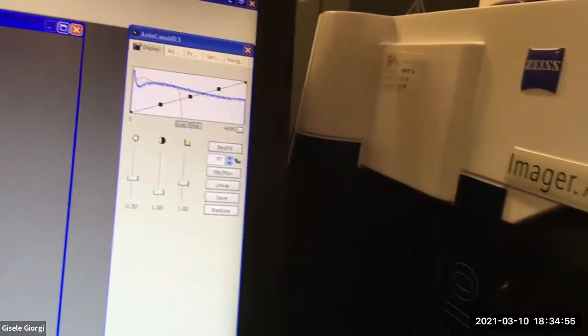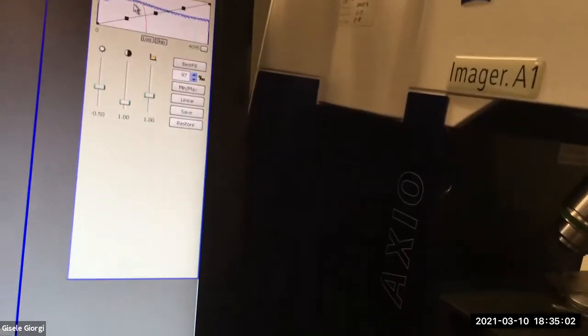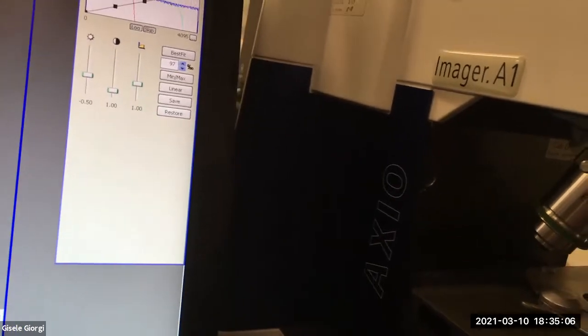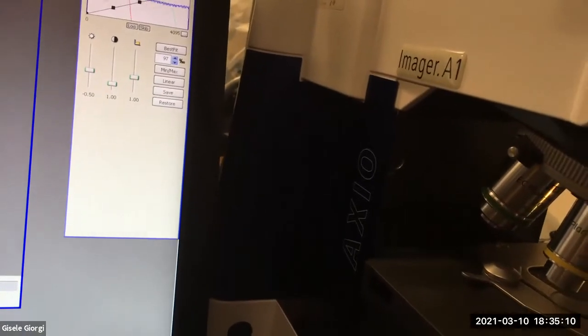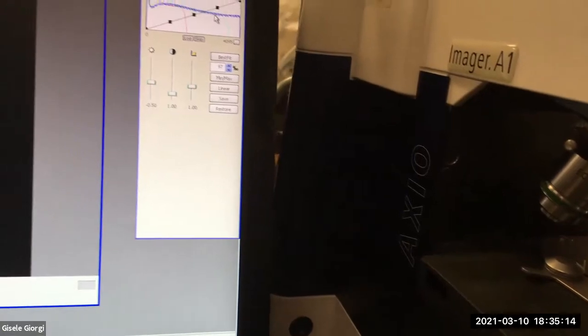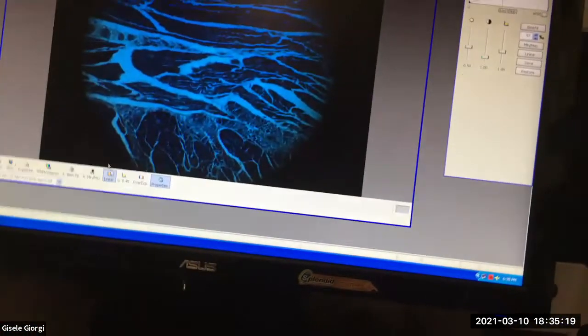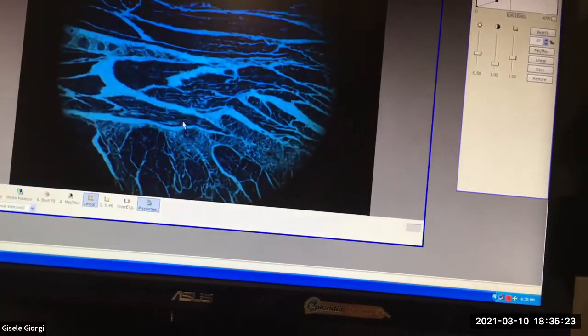Okay. This scope is, oh, look, a histogram and a lookup table. See, histogram, because this is a color camera having a moment. I don't remember this being color. I guess it is a color camera. It has three histograms. You can see that the blue is out of whack. There shows up in the histogram too. There's my lookup table. Ooh, that's right. I was going to show you some of this thing. Let me hit it up.